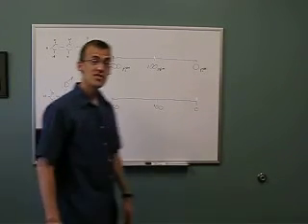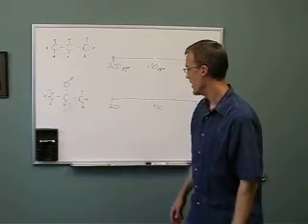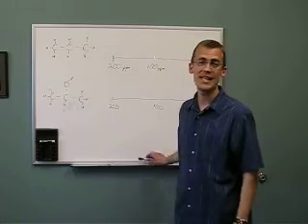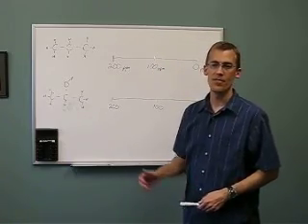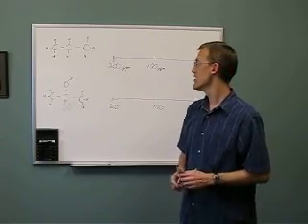All right, now that you have some idea of what's going on inside the instrument, I think, or at least I hope, it will make it easier to understand why the spectra look like they do and maybe how to interpret them.